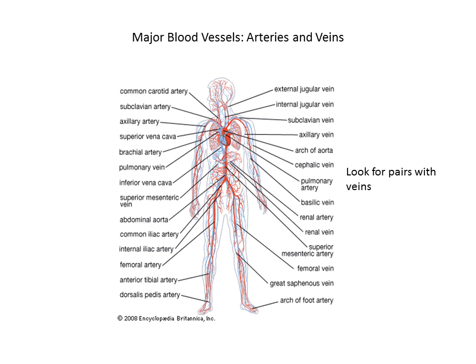because I can read a list just the same as you can. I'll point out a figure like this, that a lot of the structures, a lot of the blood vessels come in pairs. So if you have an artery sending blood to one place, you have a vein returning the blood back. And look for those pairs. They're often named the same, and they should help you identify where you're at variously.